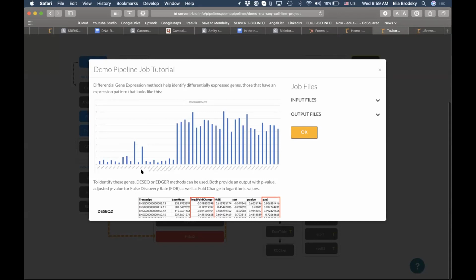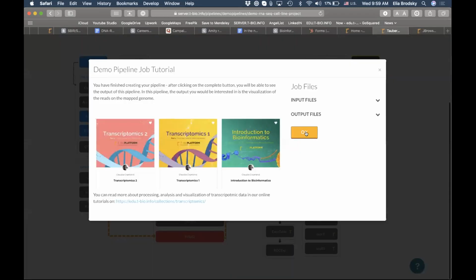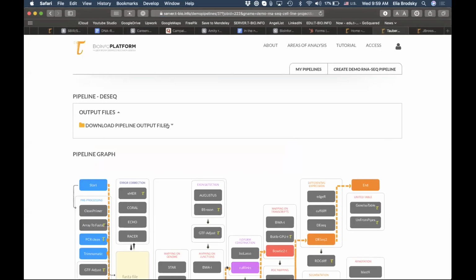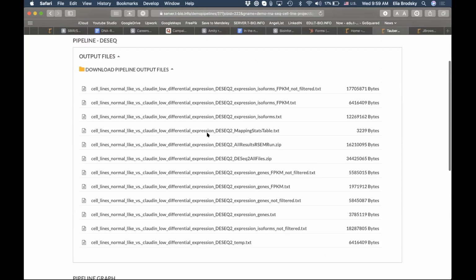So for example, this is condition number 1, this is condition number 2. Where are those statistically significant genes that are differentially expressed between two conditions? So we'll talk a lot more about some of these concepts in our lectures, but I also encourage all of you that this is covered in transcriptomics too. You can learn about the p-values and the false discovery rate and all kinds of other concepts that are relevant to this topic.